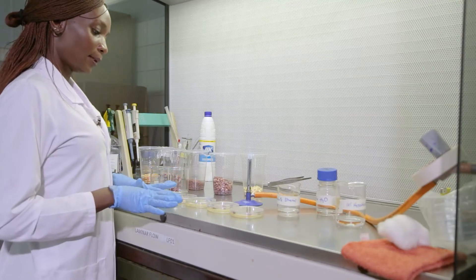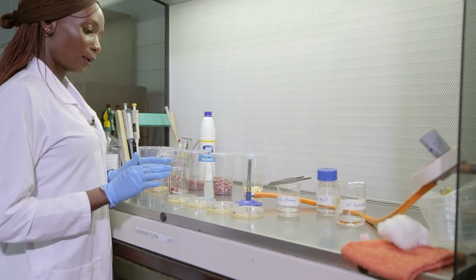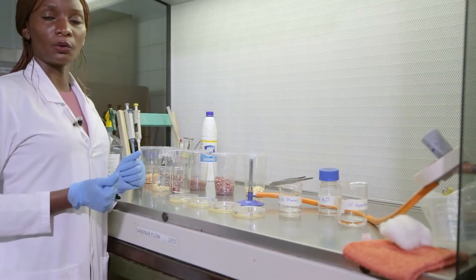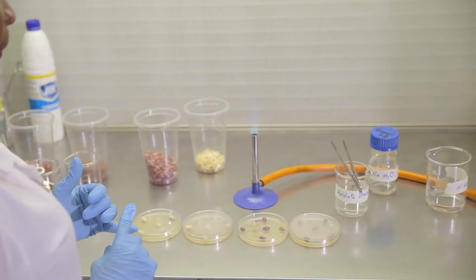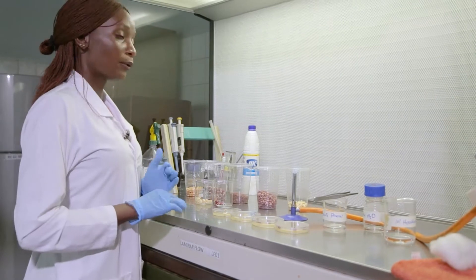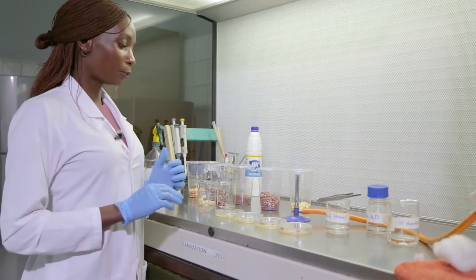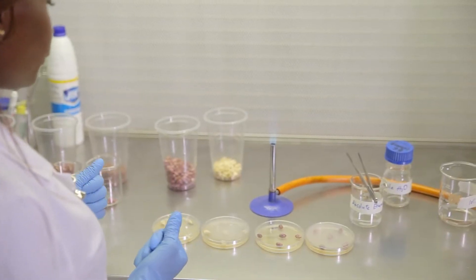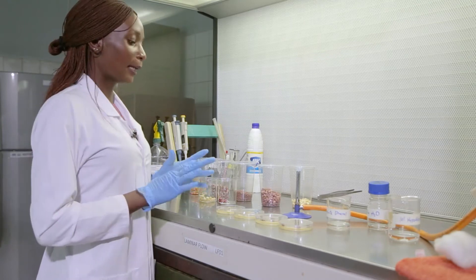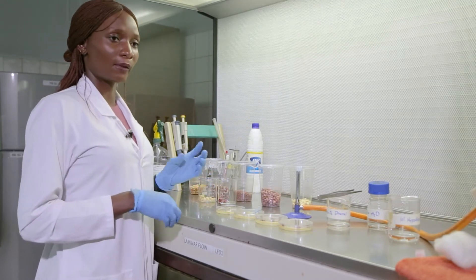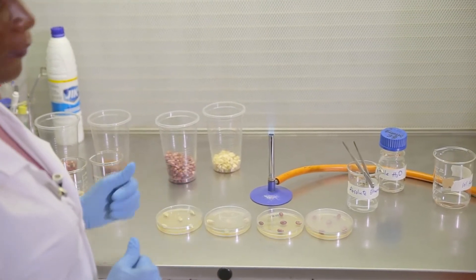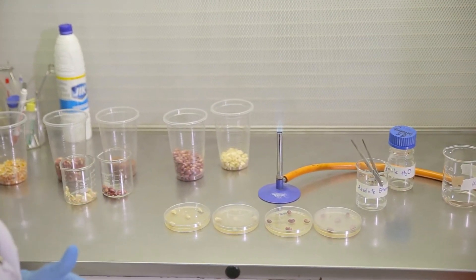So having put our seeds on the agar in duplicate—remember, we do this in duplicate—we are carefully going to carry the plates to the incubator. Incubation can be done at 30 degrees for 72 hours, or you can do it at room temperature for five days. What we are investigating is if we have any internal mold infection. Within three to five days, if there are any molds in the internal surfaces of our seeds and grains, they will be seen growing on the surface of the agar. So after this step we are going to the incubator.